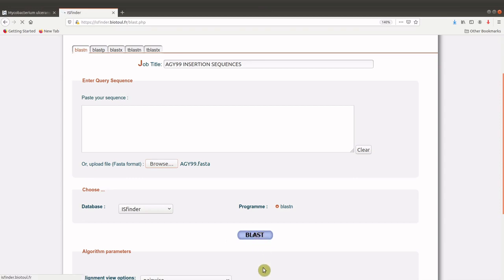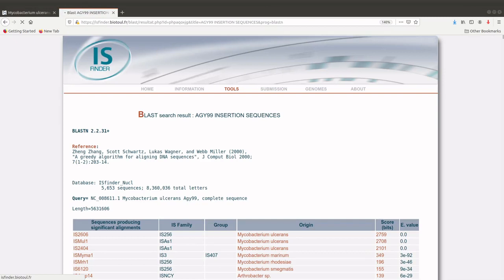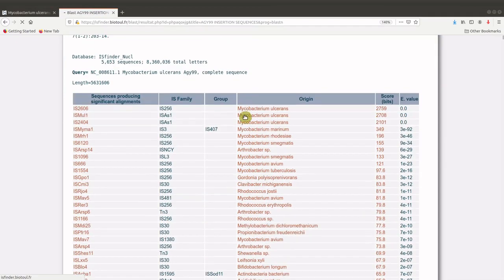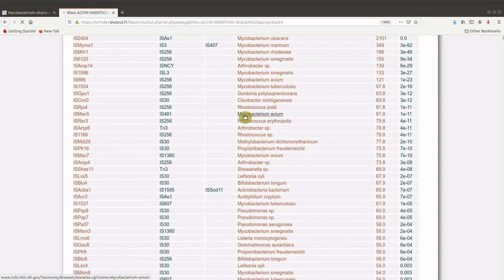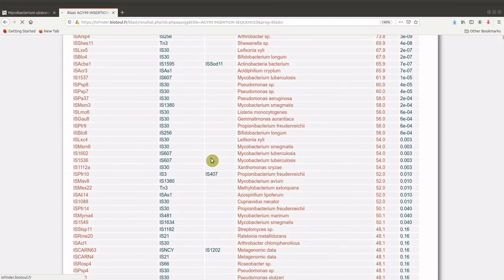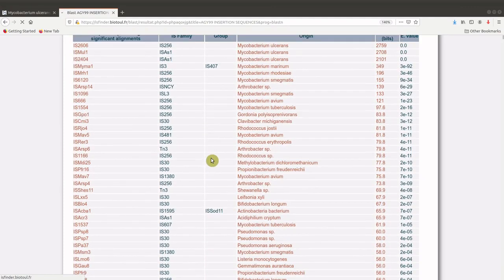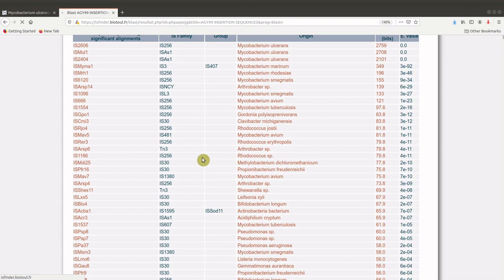And then we wait for the results to be given to us. So we have the search completed and we have the results. If you look at the hits, we have a number of insertion sequences that have been given to us.